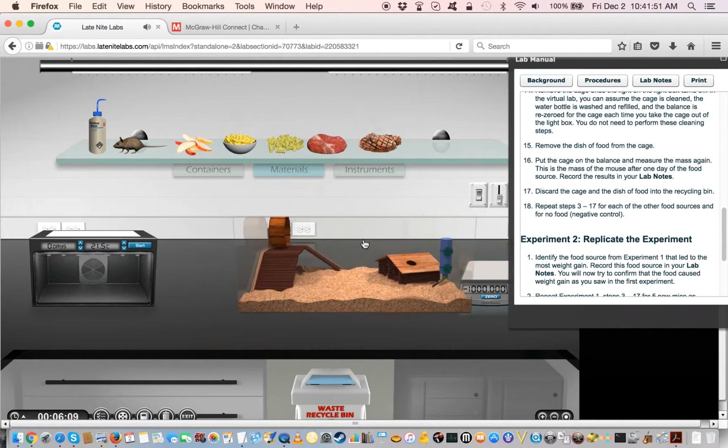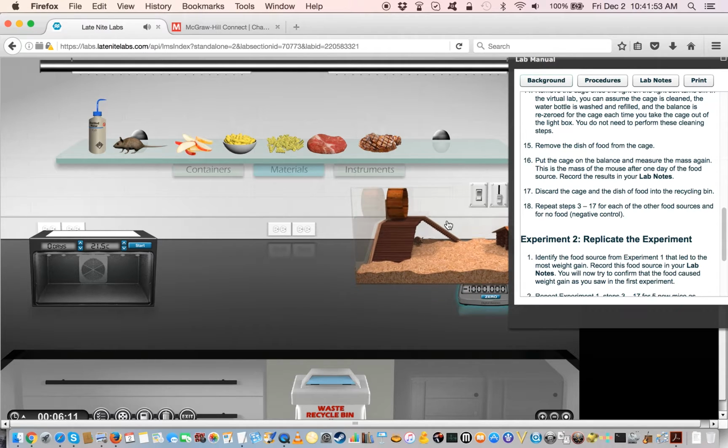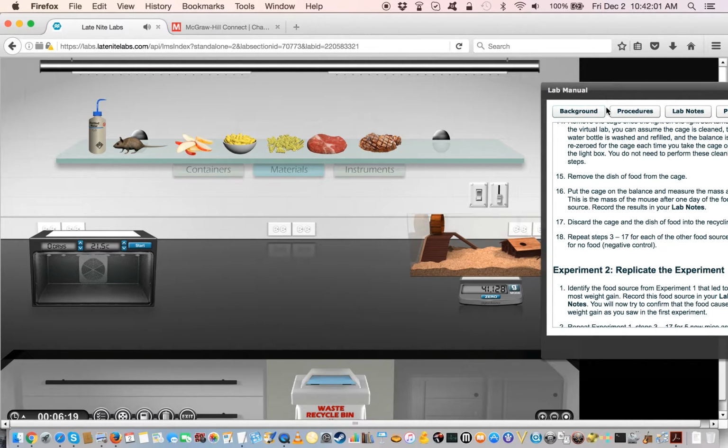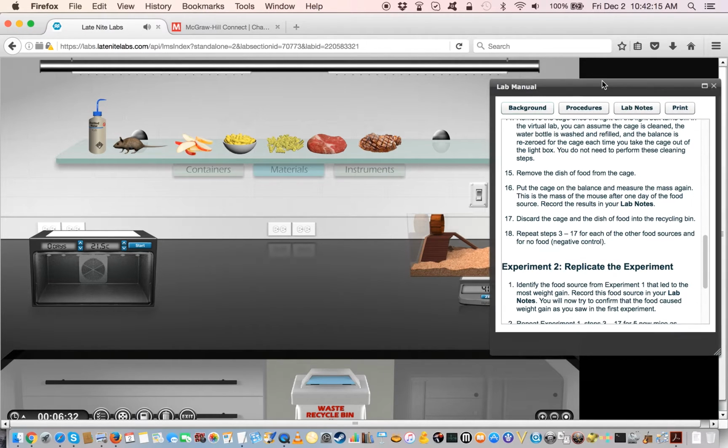Right, so now we put the cage back on the balance and we'll see what we have here. Now that is the new mass of the mouse. If we've been feeding it something, chances are it's going to be higher than what it was. So that's what's happening here. Obviously you want to write down this new mass, and then that will allow us to calculate a change in the mass of the mouse.